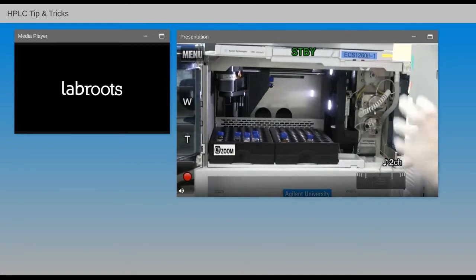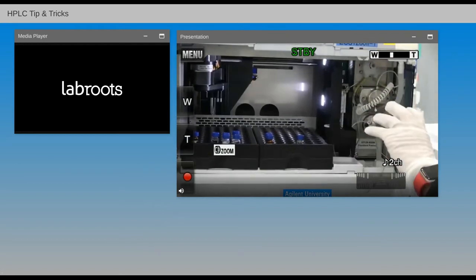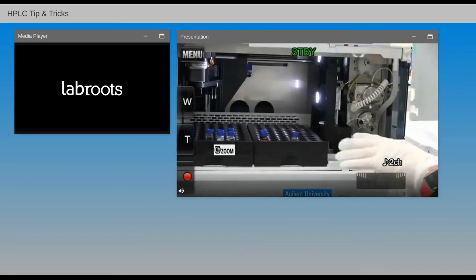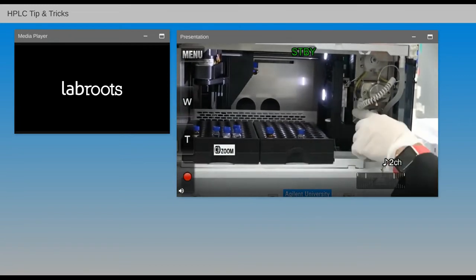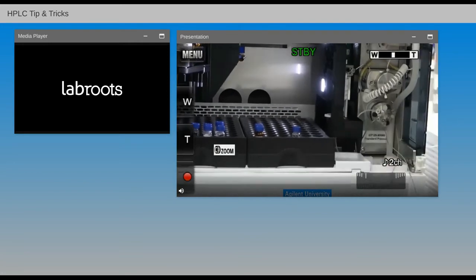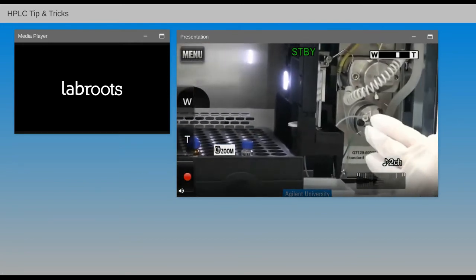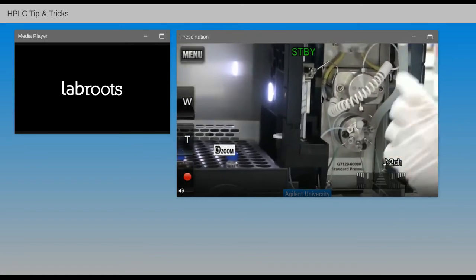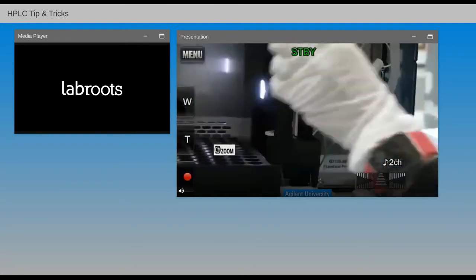And then when you flow through this capillary tubing, there is an injection valve inside where they switch between the bypass mode and the main pass mode. When we say bypass, meaning that they are bypassing the needle seat, and then the solvent will go straight into the column. Bypass mode will only happen when the needle needs to lift up to draw the sample.